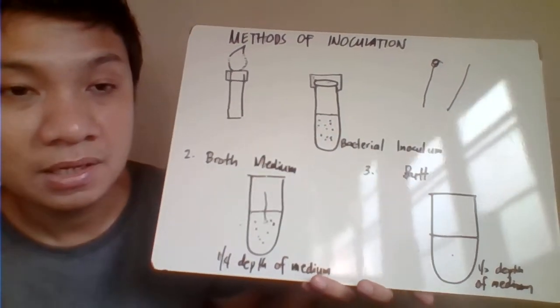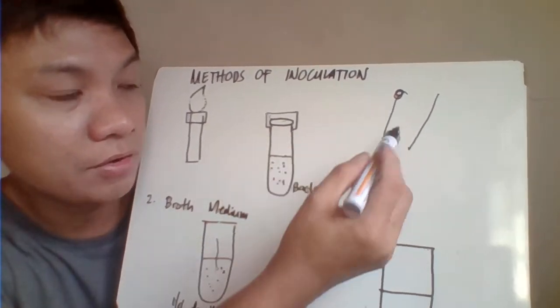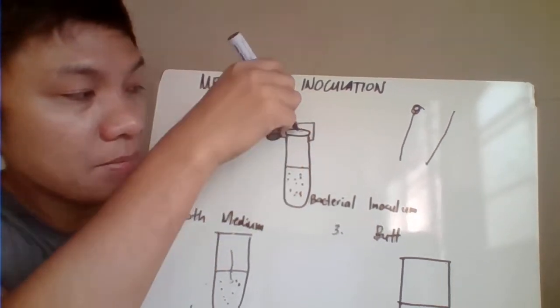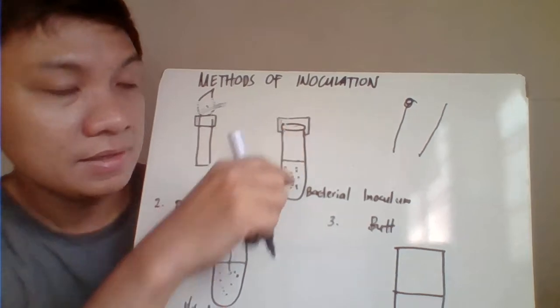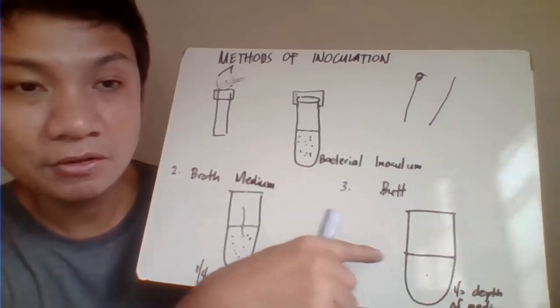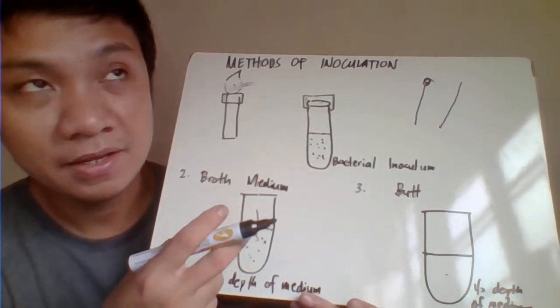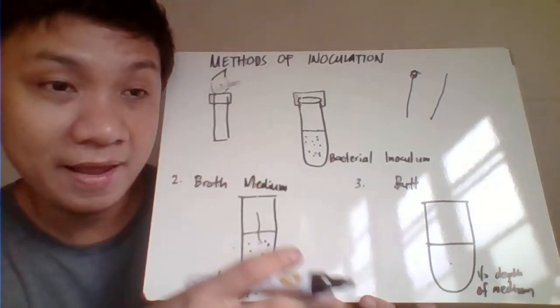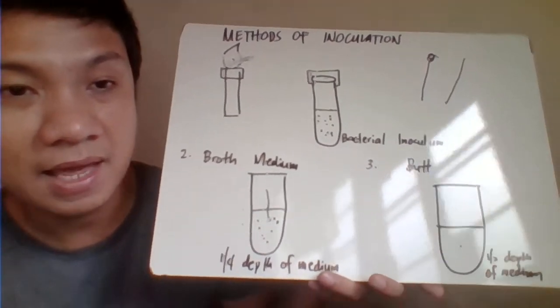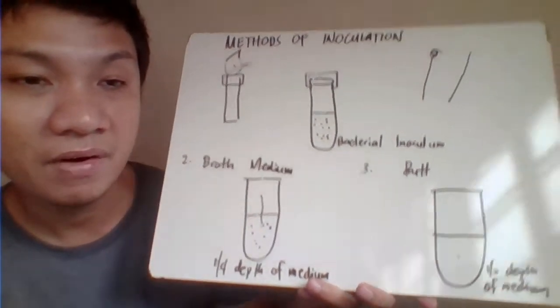Okay, how are you going to inoculate your bacteria in your agar culture medium? So again, with your inoculating loop, i-flame mo yung inoculating loop, then kukuha ka ng bacteria inoculum. Every time you open, you flame. After closing, you flame. Ganun din dito sa mga culture media natin. Before you open that one, you flame. You open, you flame. Then you close, then you flame. So ganun ang ating aseptic technique. Again, that's to prevent the entry of contaminants or those organisms from the outside environment.